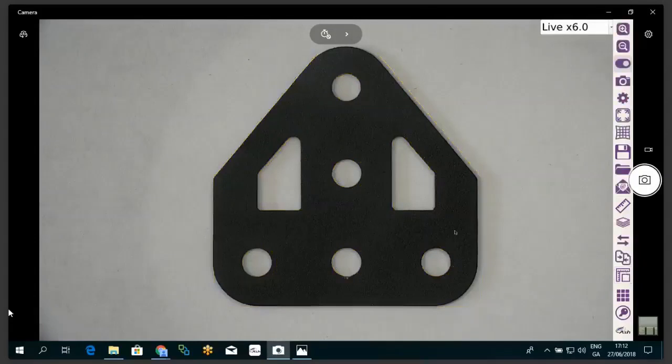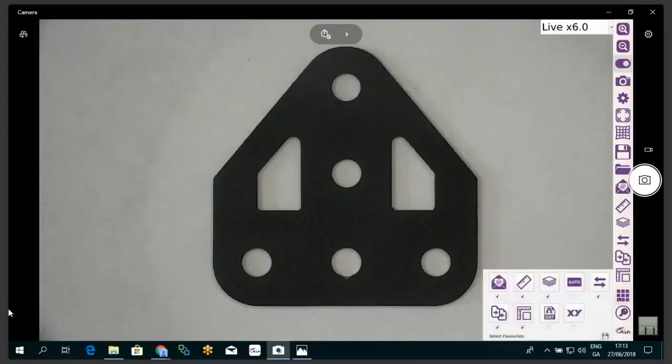A step on from that, we can also work with measurement files automatically. The next app is the automatic measurements. If I click down here, this is our extended toolbar. We couldn't fit all the apps onto the toolbar because we're releasing one to two apps maybe every year.